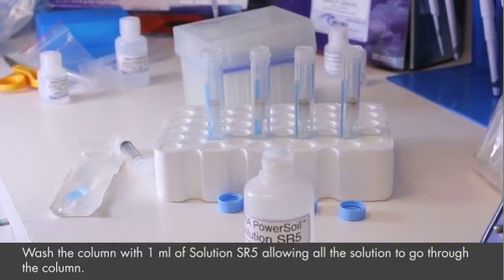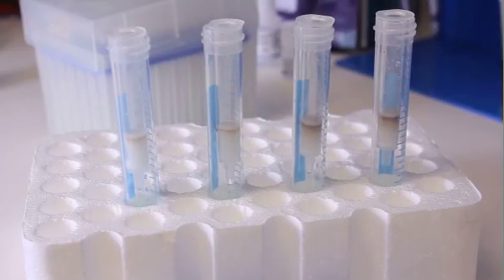Wash the column with 1 ml of solution SR5. Collect the flow in a 15 ml tube.